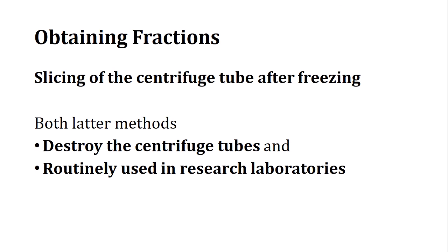And finally, if there is any close banding pattern, we can just freeze the tube at a proper temperature, something like -4 or -20, and then we slice the tube. Usually this destroys the centrifuge tubes, but it is routinely used in research laboratories. This is what we can perform.